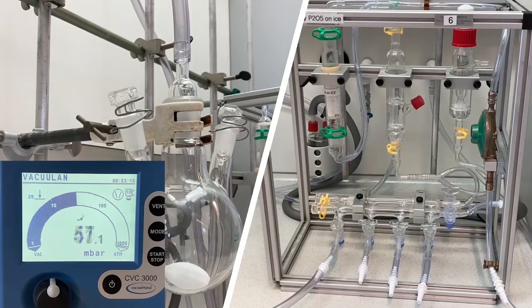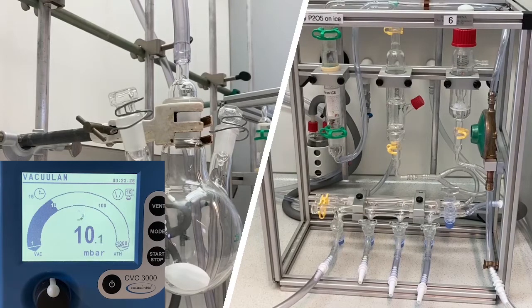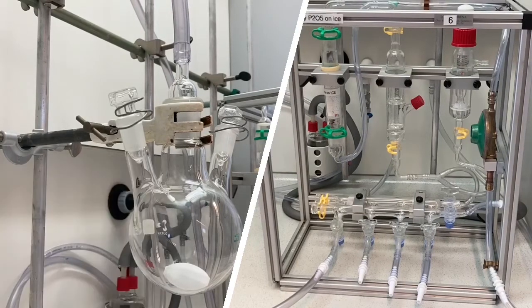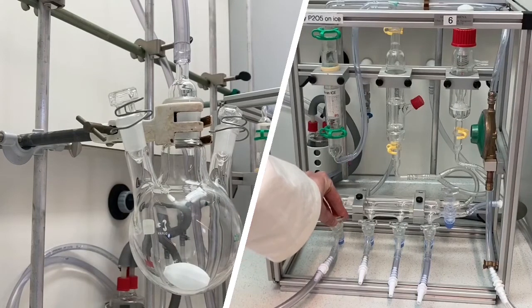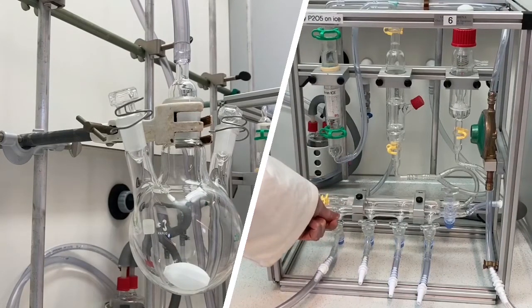The bigger the system, the longer it will take to reach full vacuum. If you use a pump, you will hear the pump change pitch when it has reached full vacuum. Alternatively, check the monitor of the in-house system to see if the pressure is stable. When it is stable, close the tap and slowly open it towards the nitrogen.